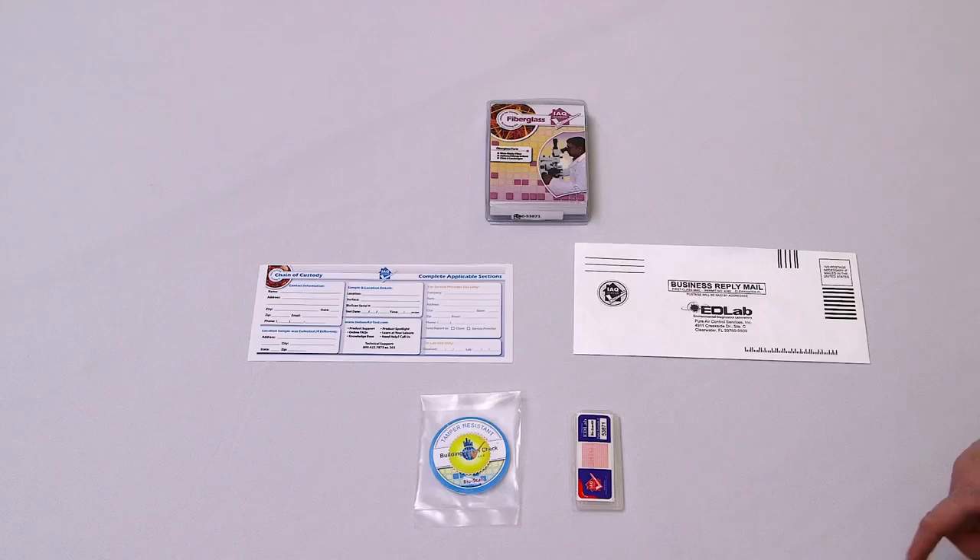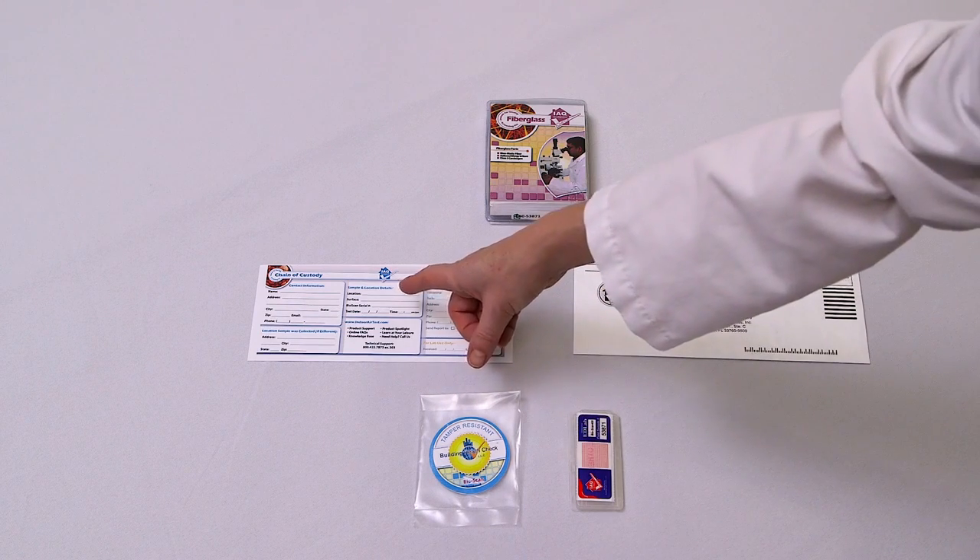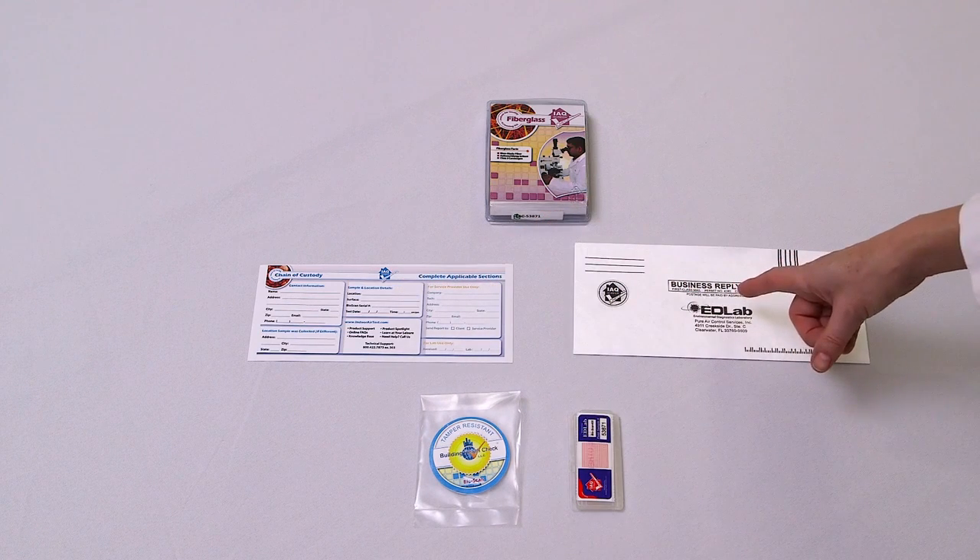Our fiberglass screen check test kit is easy to use and is an excellent indicator of the level of fiberglass that may settle on surfaces. The kit consists of one Bioscan 400, one chain of custody form, and a prepaid envelope.